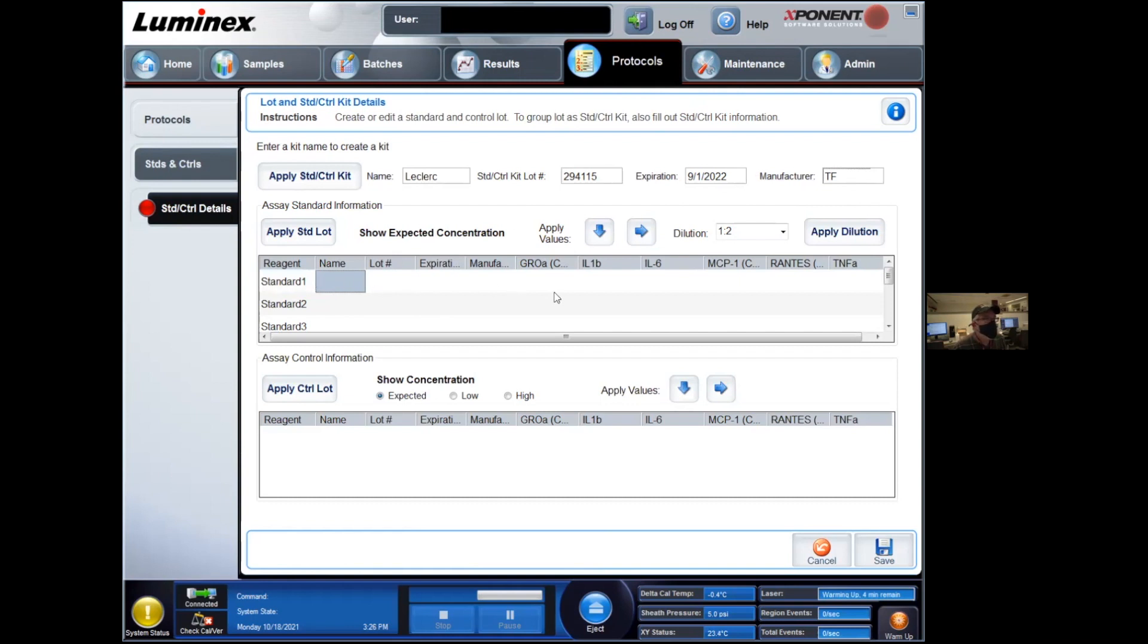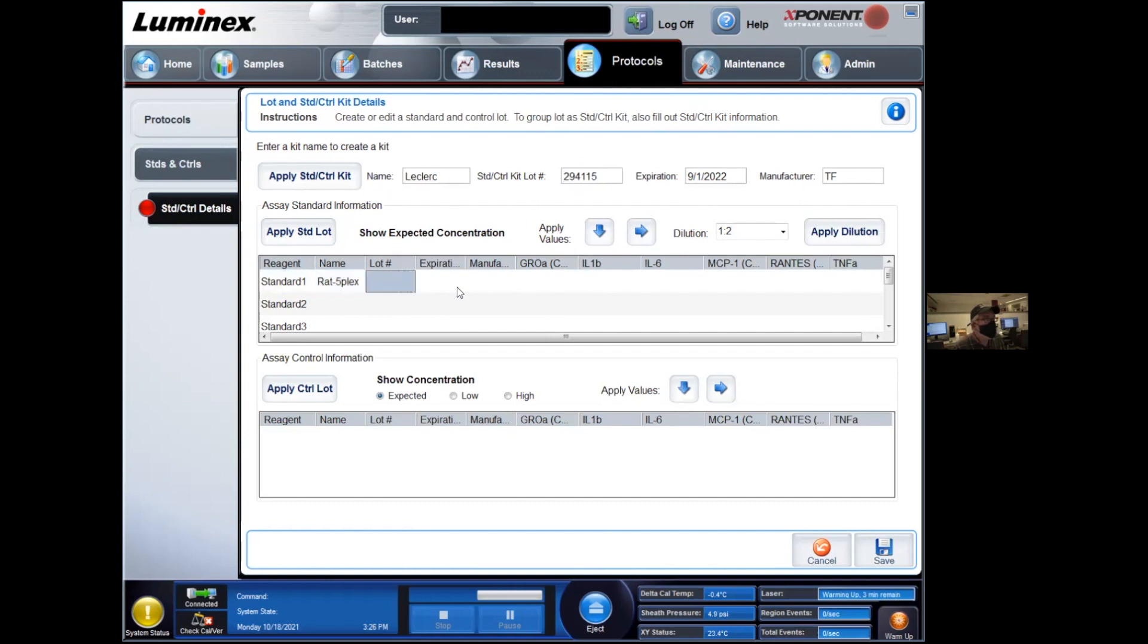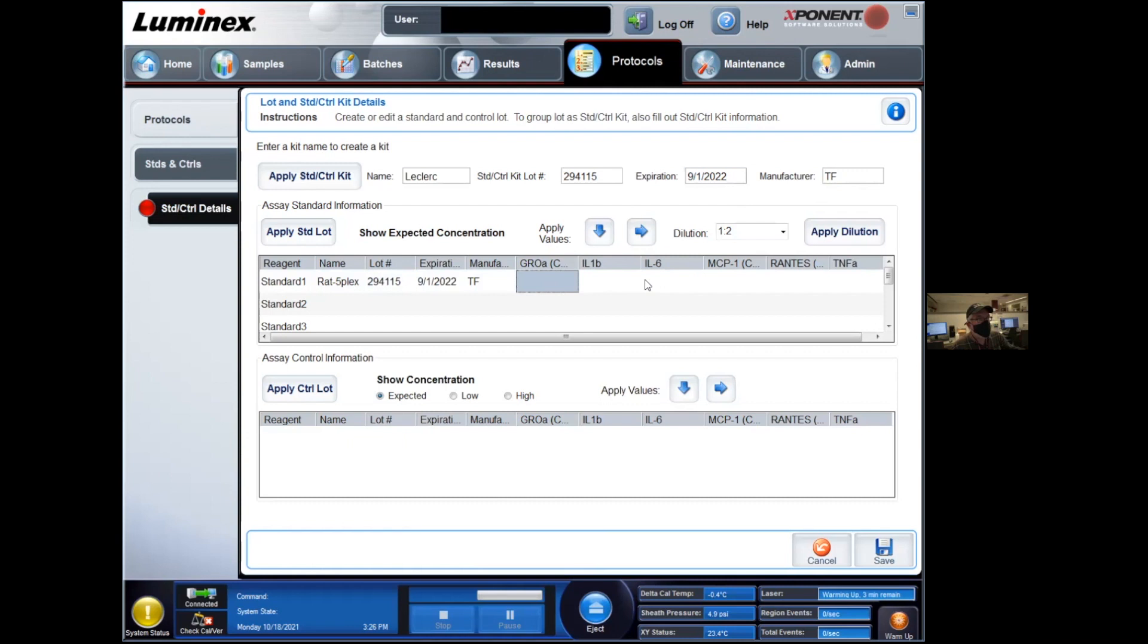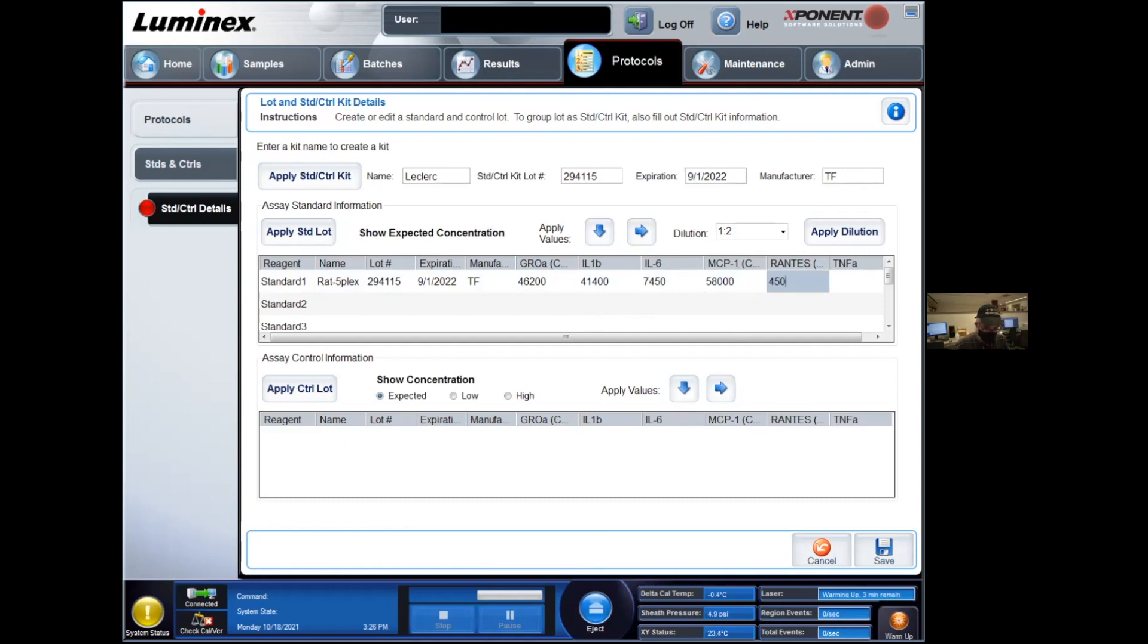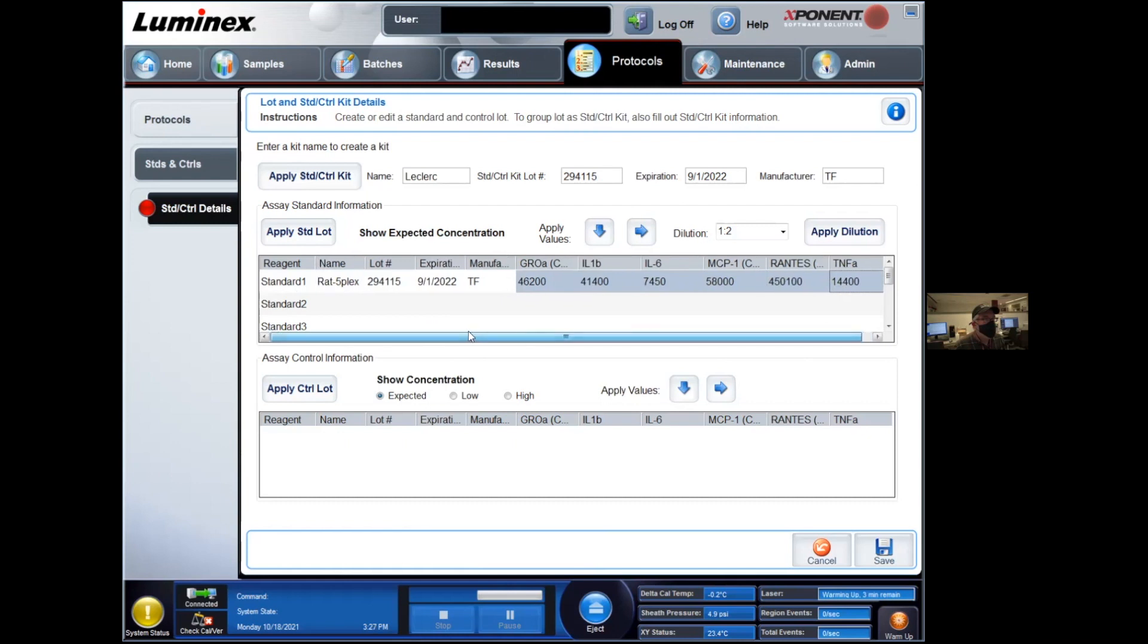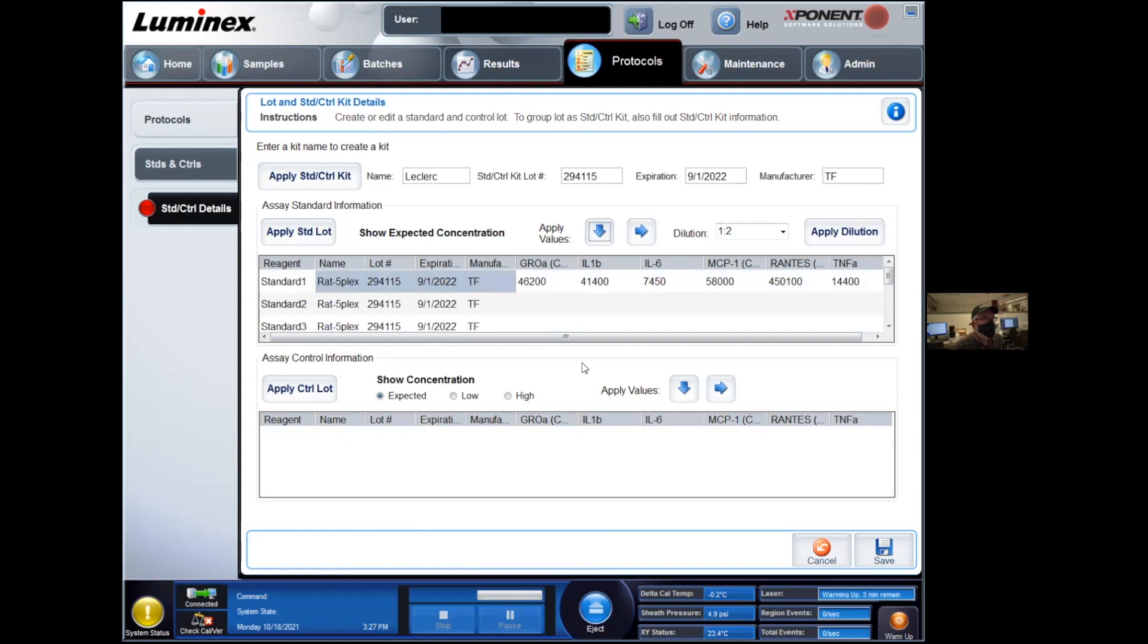For each of these columns, we are asked to provide some information. So this might be like a rat, five flex, lot number. Cut and paste is your friend here. And now you have to enter the standard one concentration values. Again, present in your certificate of analysis. And now we need to fill out the rest of this table. So here's a quick tip for every column where the information is the same. You can highlight them and click on this button over here. It's going to apply values downwards.